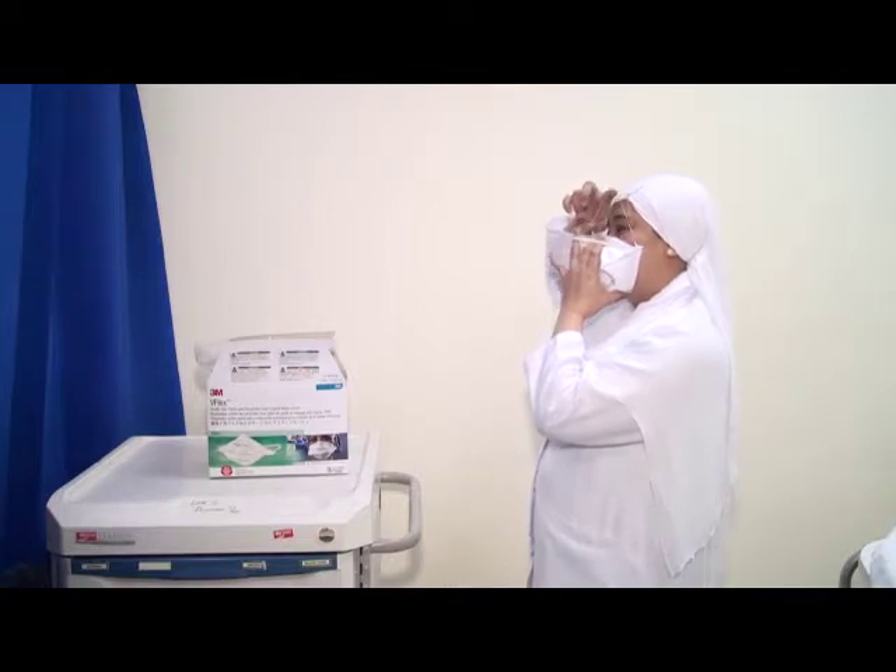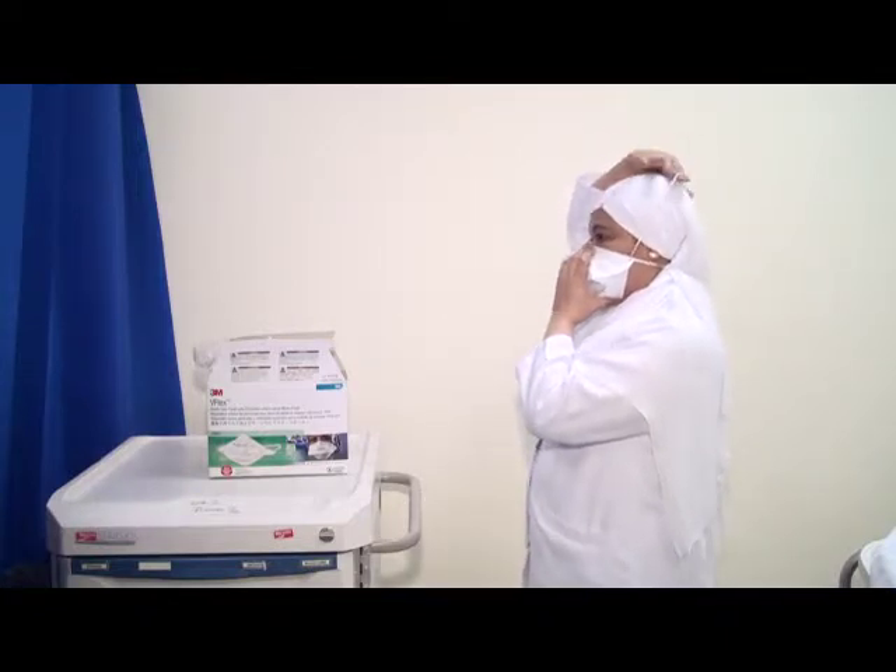Pull one strap over your head and position it around the neck below your ears. Pull the second strap over your head and position it high on the back of your head.